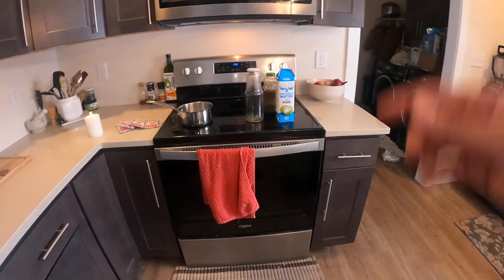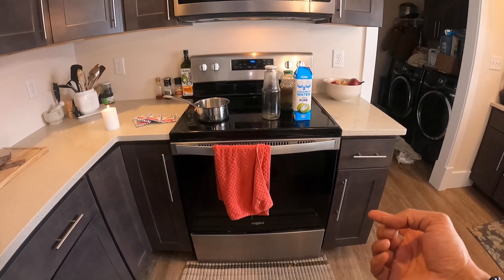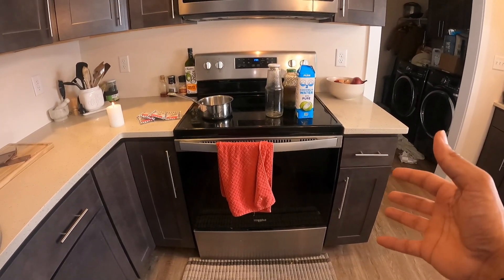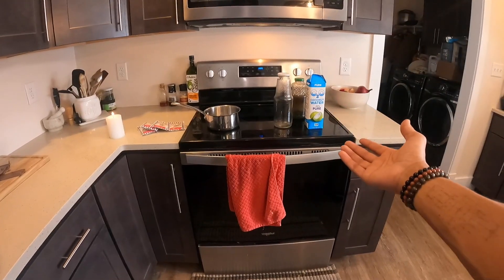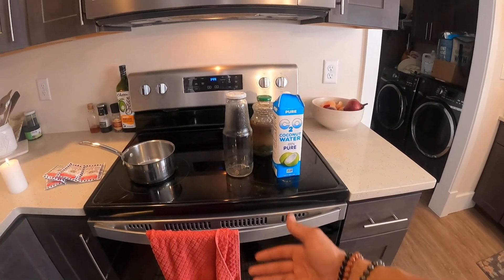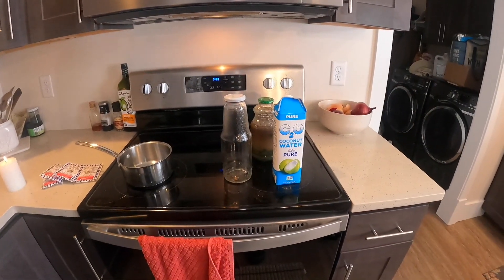Alright guys, today we're going to be doing coconut water agar. This is my go-to agar recipe. It's super easy — I've experimented with a lot of different agar recipes, but if you live in the United States this one's super easy because there is just an abundance of coconut water.